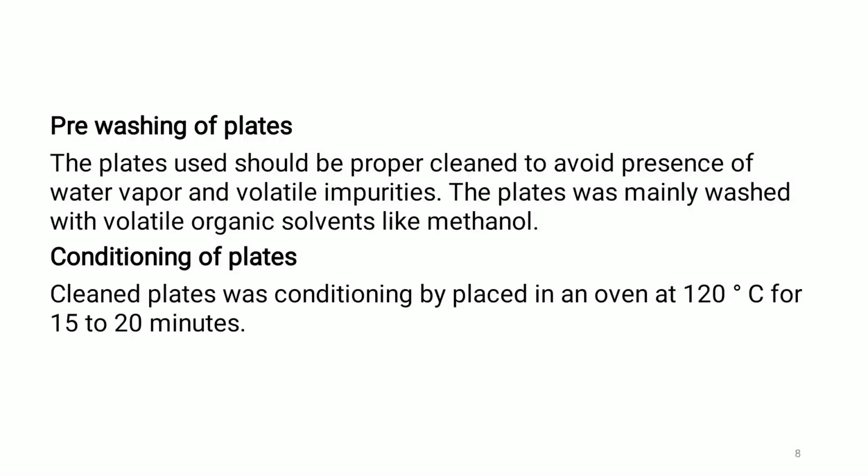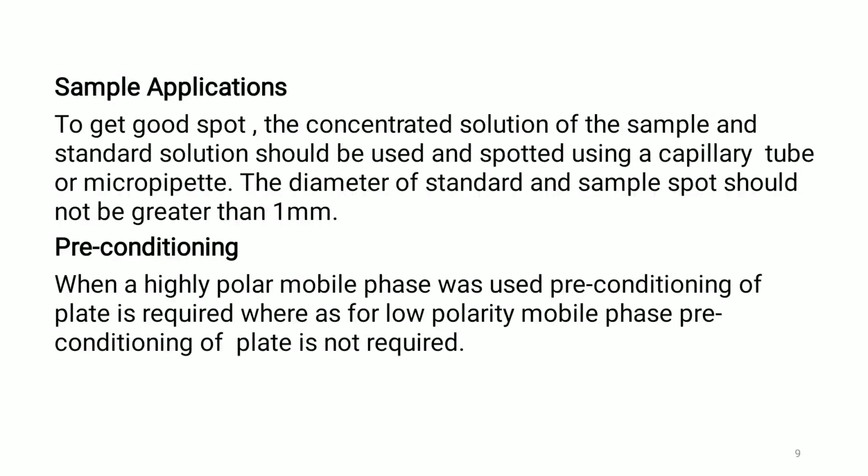After preparation of plates and making them ready for use, let's see how to apply the sample on plates. Next is sample application.